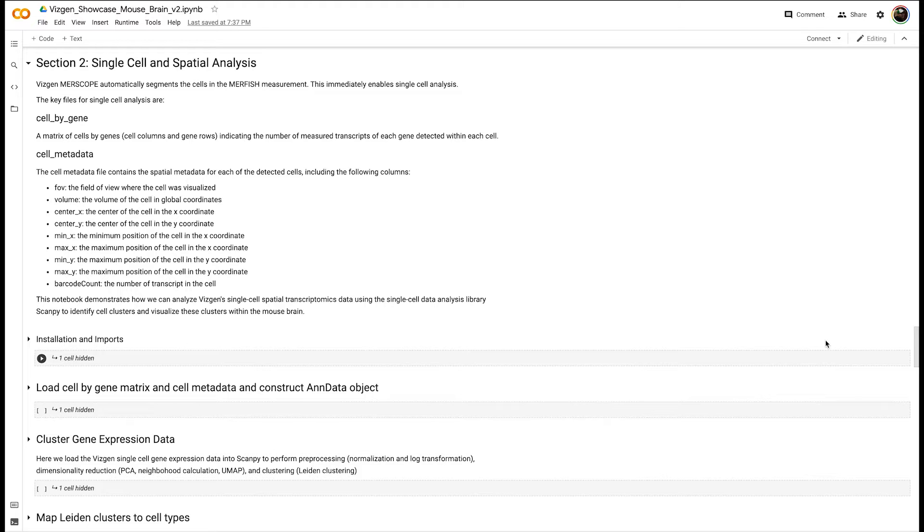We identify clusters using Leiden clustering, and then we assess tentative cell type labels using a reference dataset.